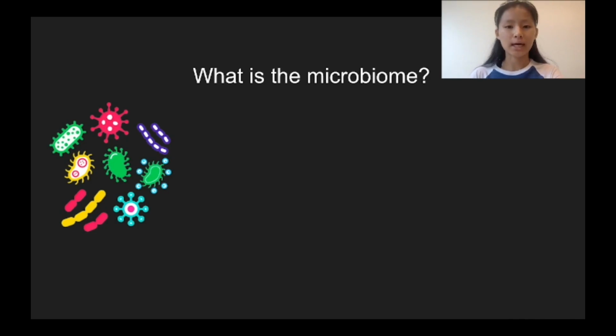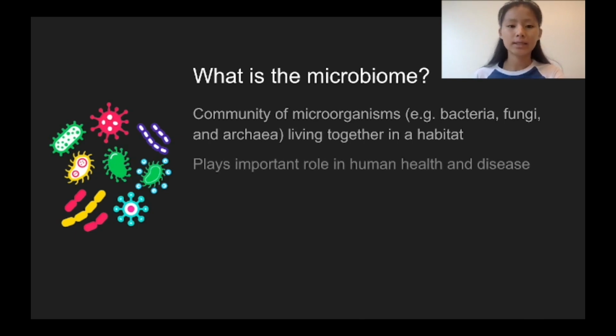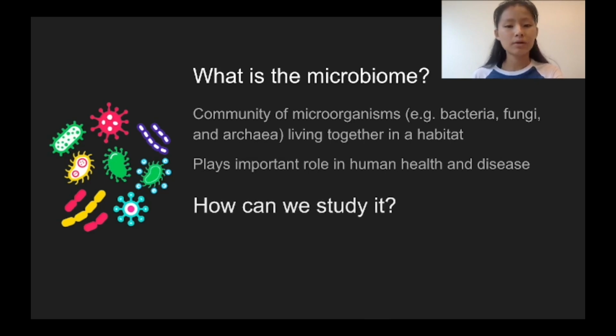Before we dive into the packages themselves, we first need to understand a little bit about the microbiome itself. A microbiome is a community of microorganisms living together in a habitat. In our lab, we are specifically interested in the human microbiome and how it plays an important role in human health and disease. There are many different approaches to studying the microbiome, one of which is metagenomic sequencing.